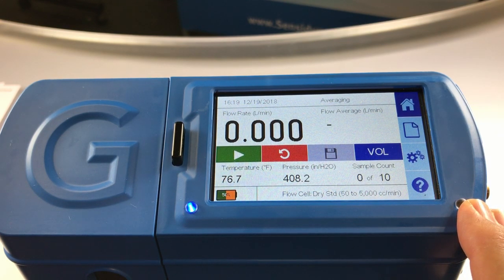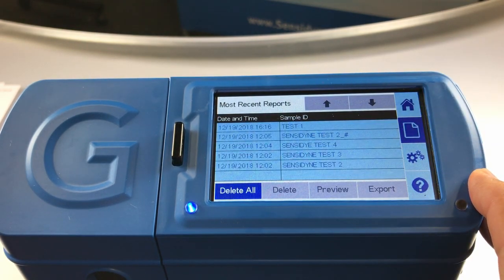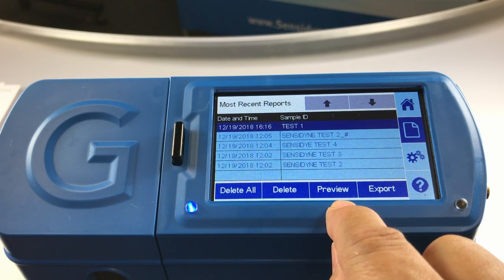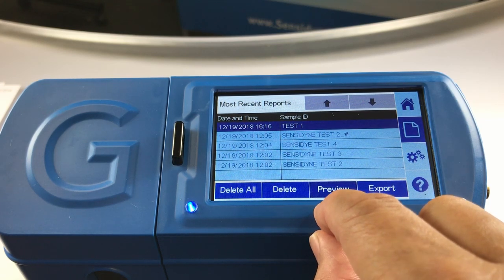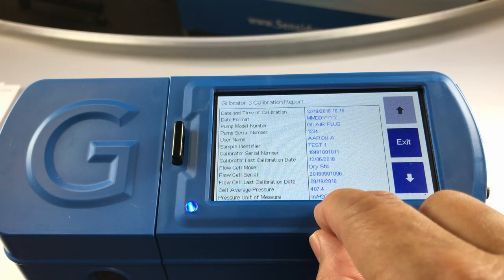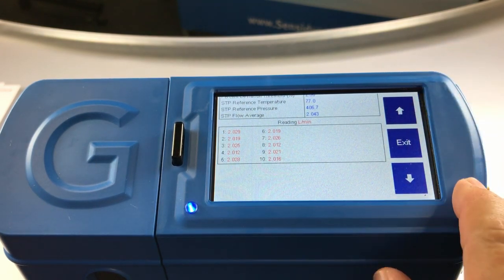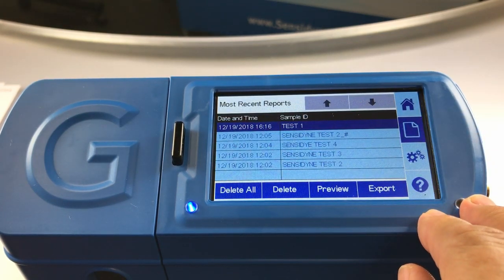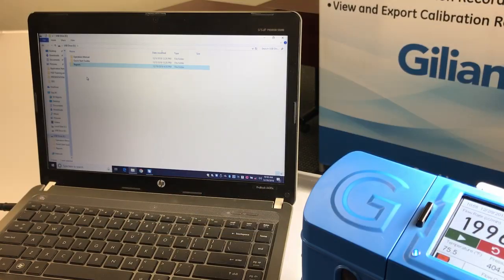Let us now check our calibration report. From the home screen, select the report icon on the menu bar. You should notice the last entry would be at the top. We'll select test one — it'll be highlighted in dark blue — and hit the preview button. It will take a few seconds to compile the bitmap report. Once the report opens, you can press the up or down arrows to scroll through and read the values. Press the exit button to return to the recent report screen. You may press the export button to save the event to the SD card if you had not selected the automatic save mode. Please note that the files will be placed in an individual folder with the sample ID name.